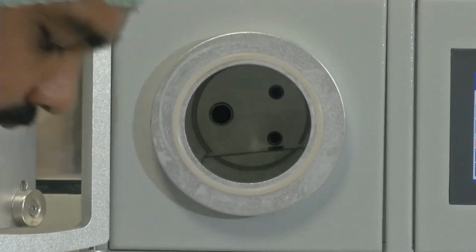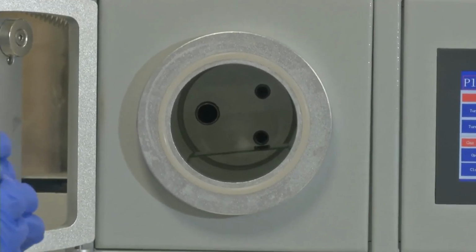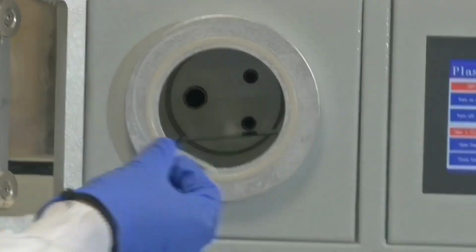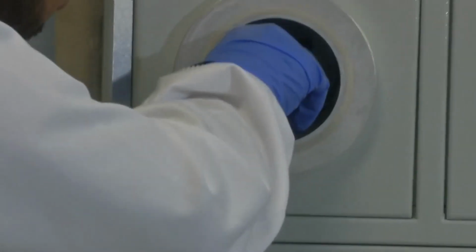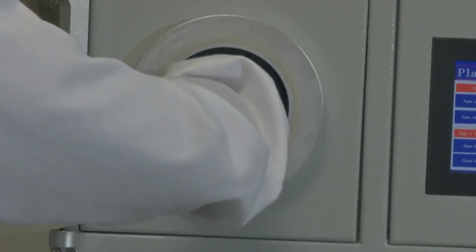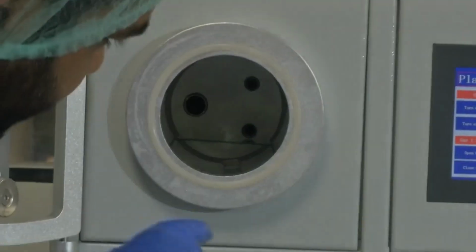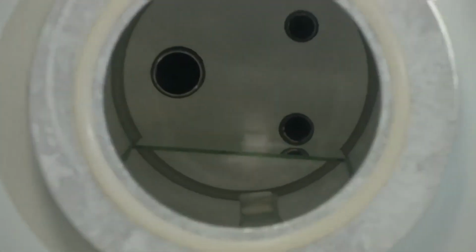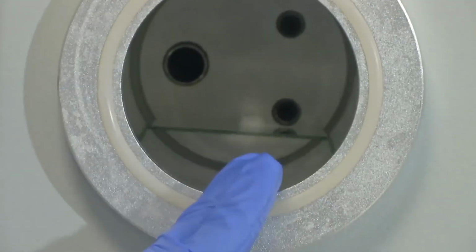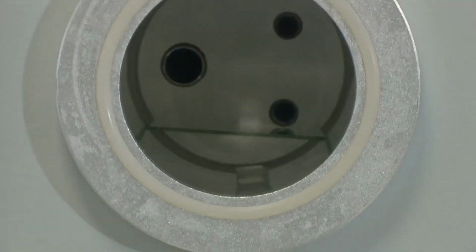So the slide is placed. Now we will flip and place the surface which we want to bond, nicely cleaned, inside. It's better that you keep it sufficiently inside. And the PDMS and the glass should not be one above the other. It should be separated so that both get treated by the plasma properly. Okay, now I have kept both of them inside. I am closing the chamber.